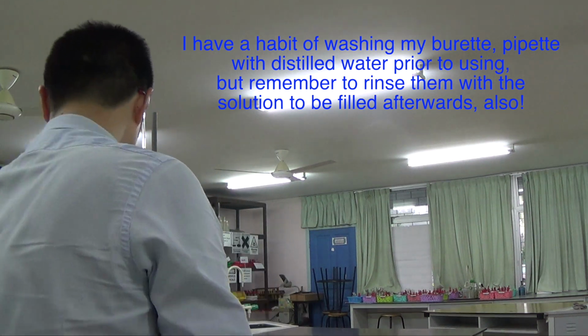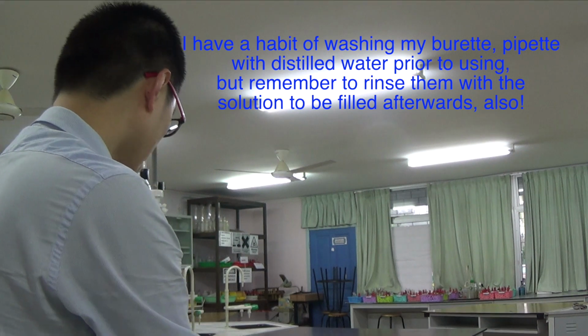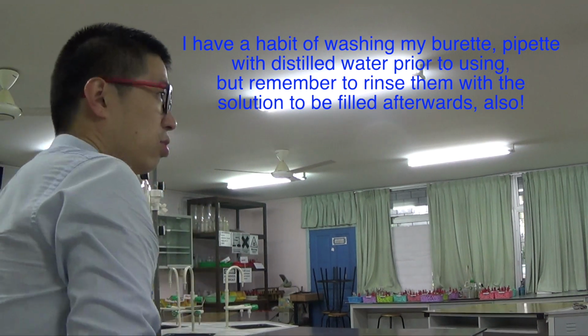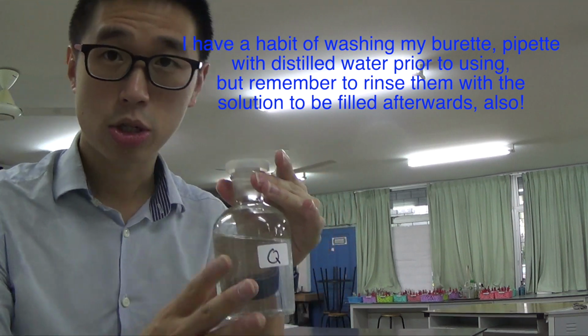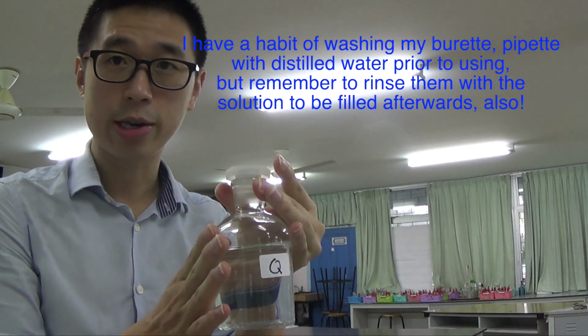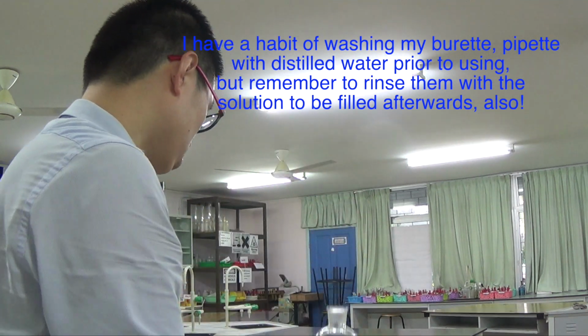But we know that P, being the iodine, is going to go into the pipette, and Q, which is our thiosulfate, Na2S2O3, sodium thiosulfate, has Na plus ions and S2O3 2 minus ions. So it's a 2 minus charge ion.